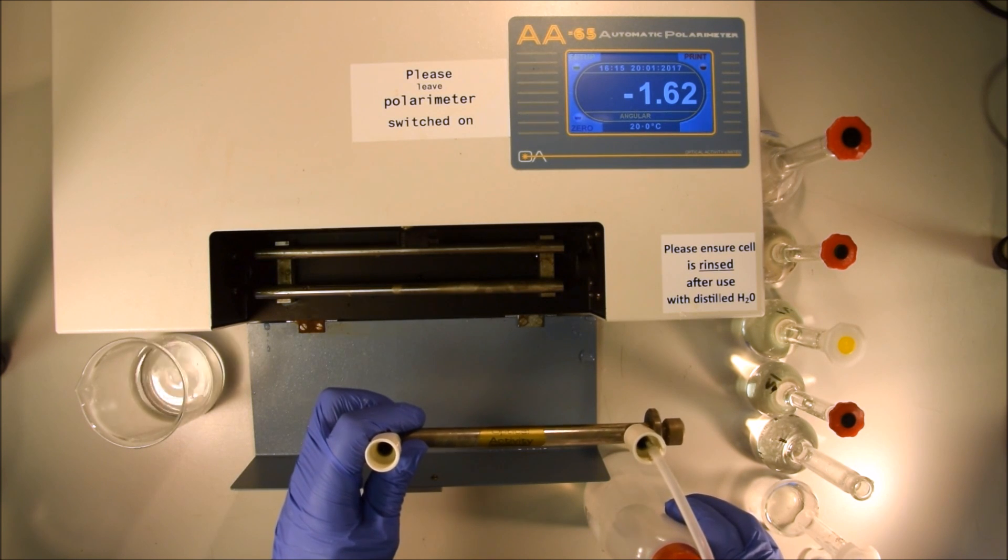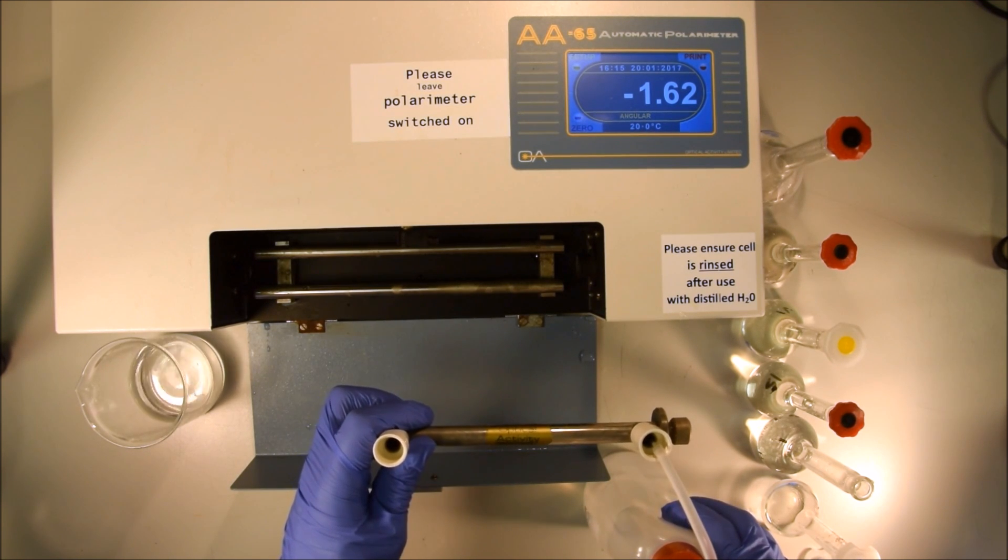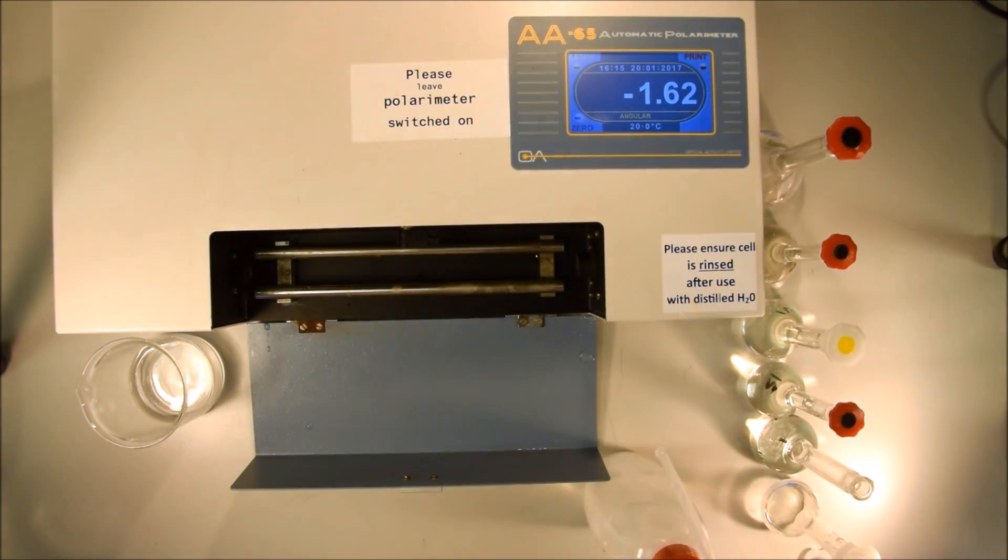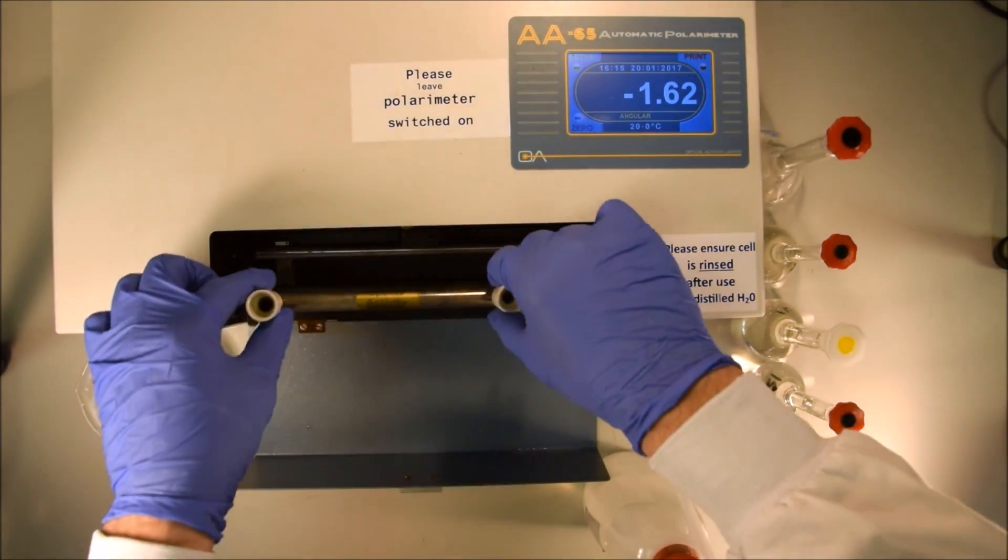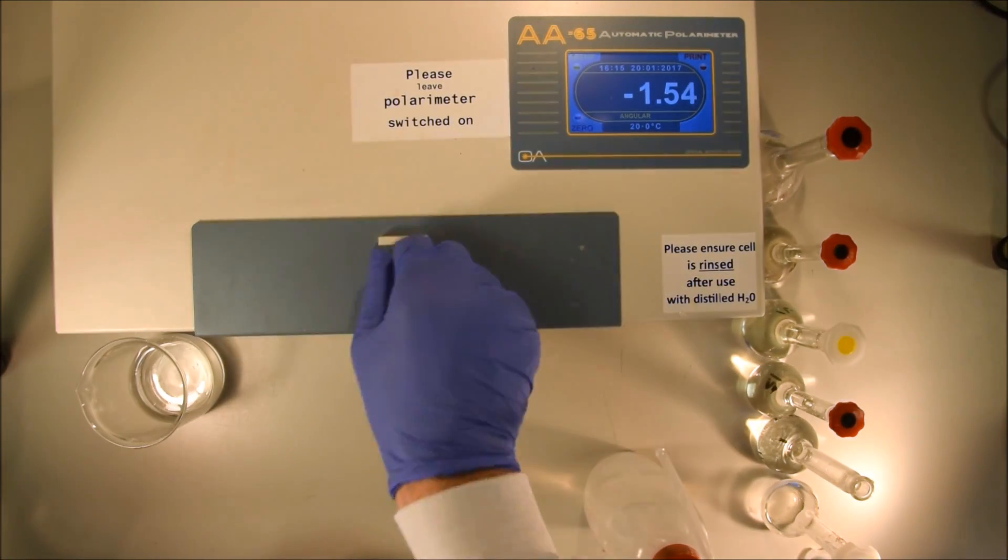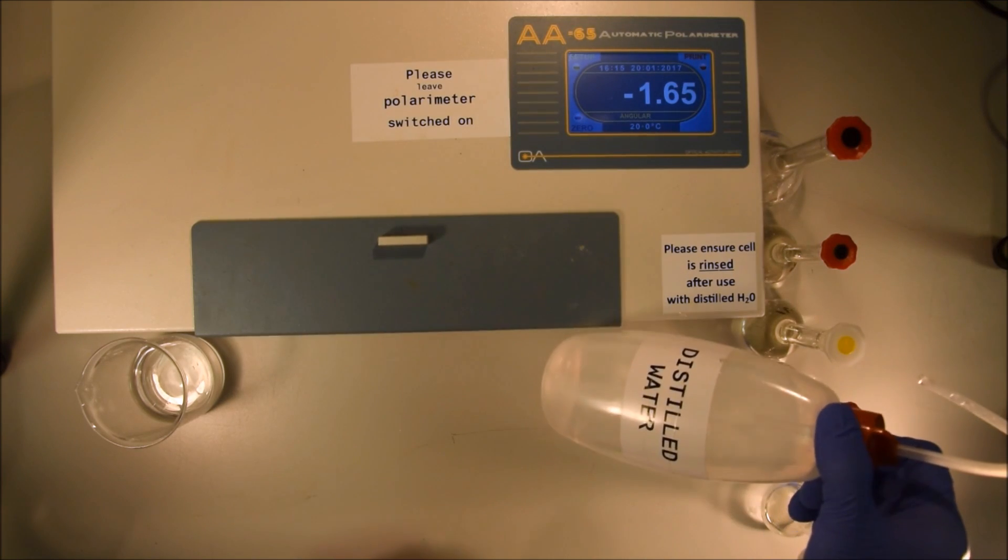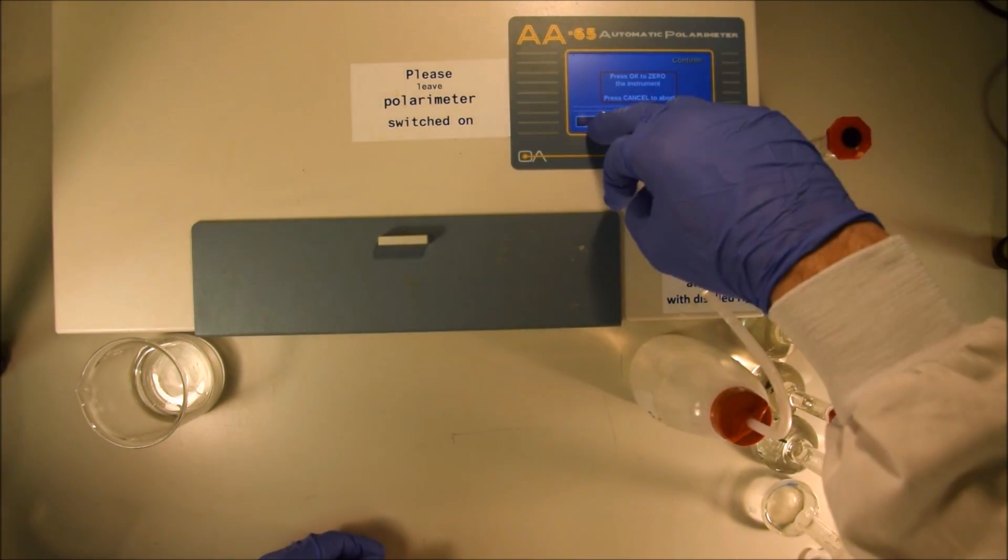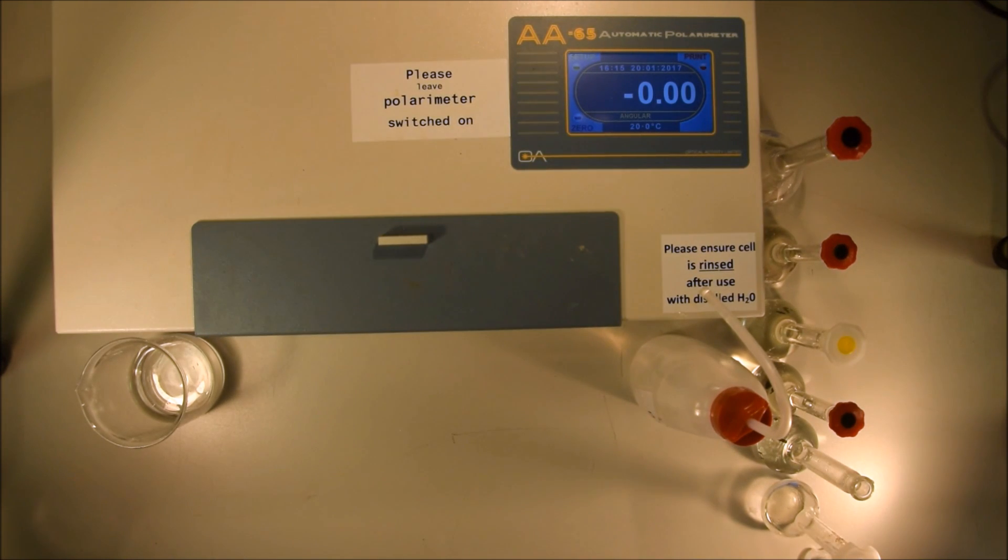We're going to fill the cell with the deionized water and use that to take a zero reading or to blank the machine. To blank the machine, it's a little different for each machine. This one has a touch screen. If you push the button or the area of the screen that says zero when the machine is filled with distilled water and then say yes, the machine will now read zero.